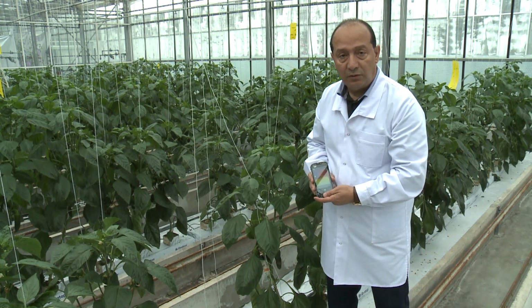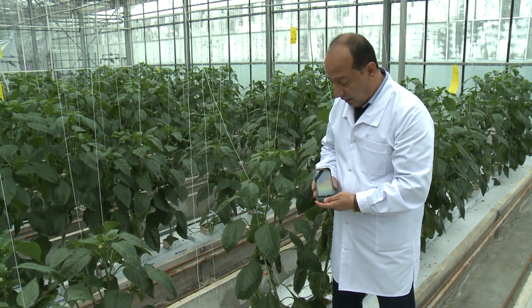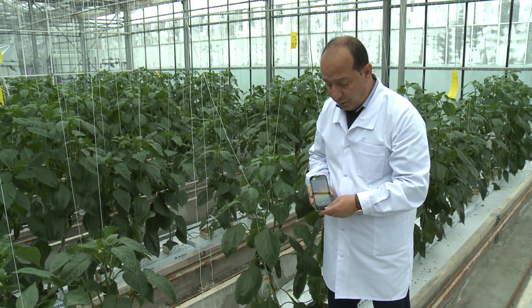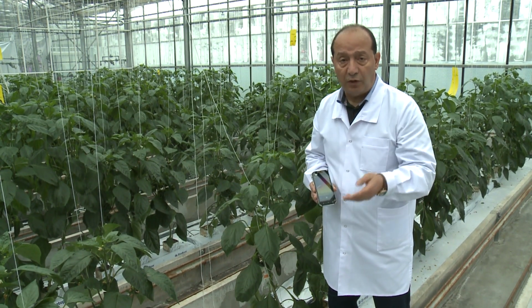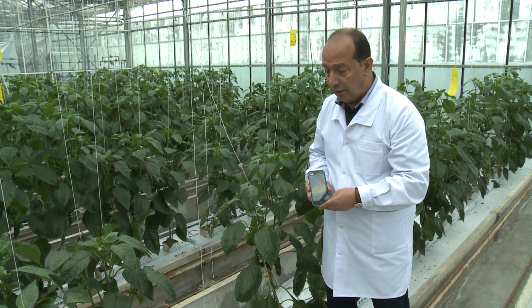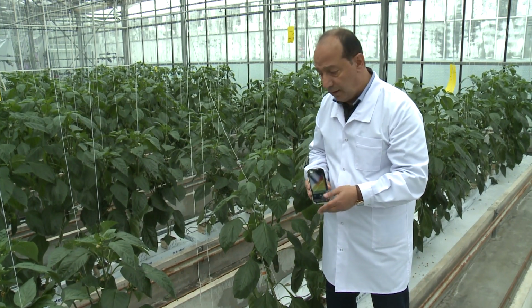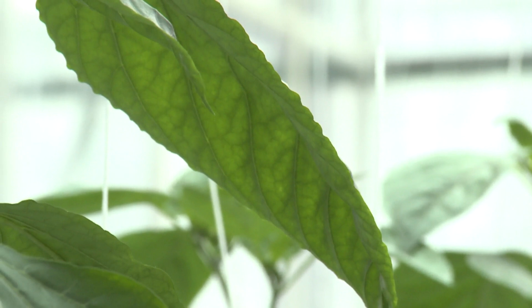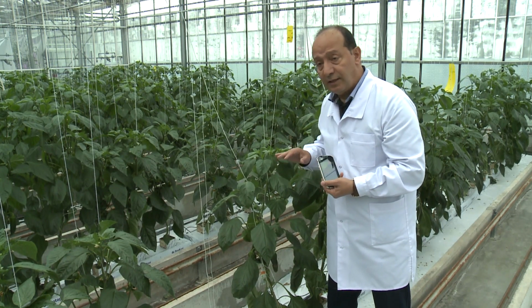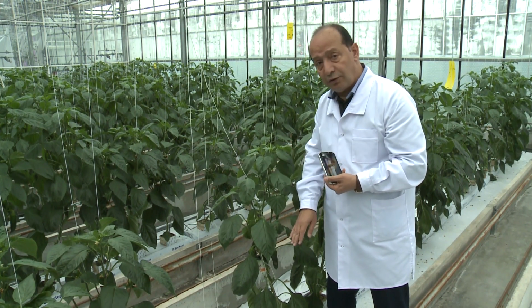The next instrument which I would like to talk about is related to measuring the temperature of the plants or the leaves. One of these small instruments which is now available on the market is addressed to measure the temperature of different objects. It's for industrial purposes, for buildings and others, but among the purposes as well, it could be applied here in the case of plant temperature. The temperature will be related to the physiological status of the plants. So if they are ill or there is any type of stressors, the temperature will be higher, especially in the case of the lack of water in the ground.